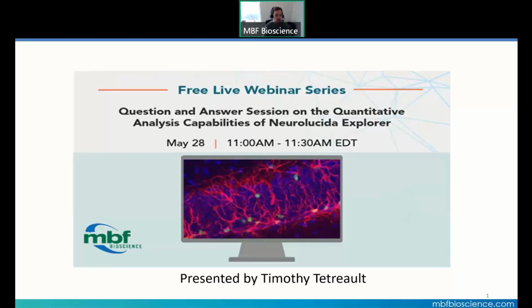Today we'll focus on questions that you might have relating to our quantitative analysis program, Neurolucida Explorer. Although this program has the Neurolucida name to it, that does not mean that it is strictly compatible with data that is coming from either Neurolucida Desktop Edition, Microscope Edition, or from Neurolucida 360. For individuals who may be working with our other programs, such as Stereo Investigator, NeuroInfo, Tissue Mapper, and many more, there are analyses in Neurolucida Explorer that can help answer questions that would go otherwise unaddressed.